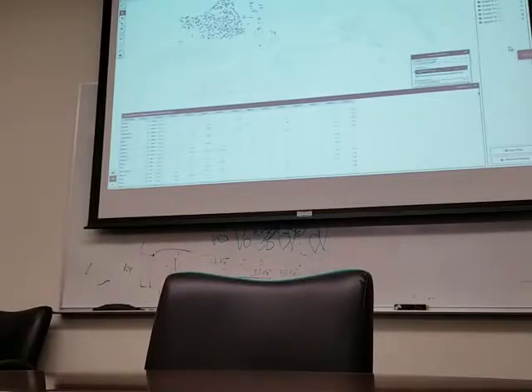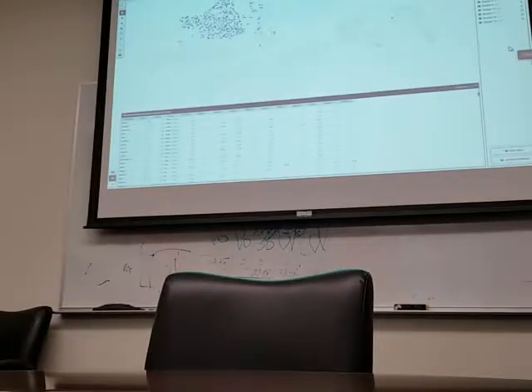and maybe such as in the grant that I'm writing, due in a few weeks. But this is just a nice interactive way to deal with it, and it helps show you, I don't know specifically what genes you guys are interested in.